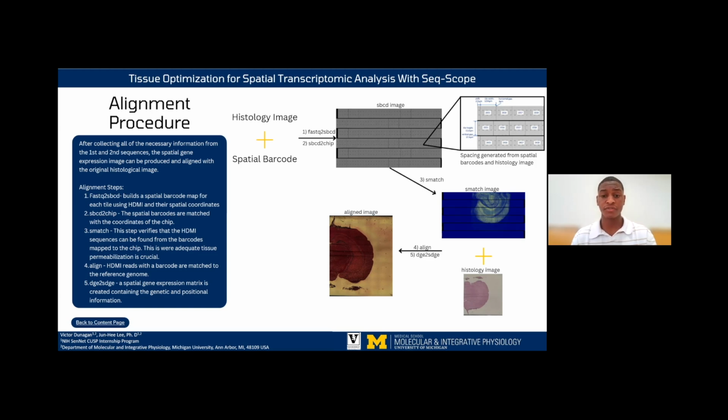And so first off, this algorithm starts by taking this information and segmenting the image into discrete squares, as you can see in this image, and it spatially builds barcode maps within each of these squares. And then after each of these segmented squares has been mapped, they're all paired together within a single image to produce a spatially barcoded image.